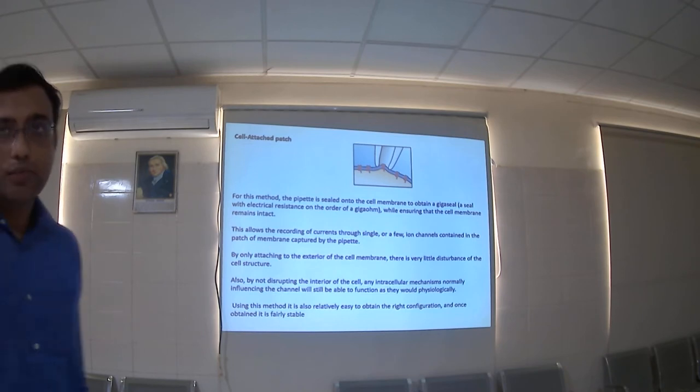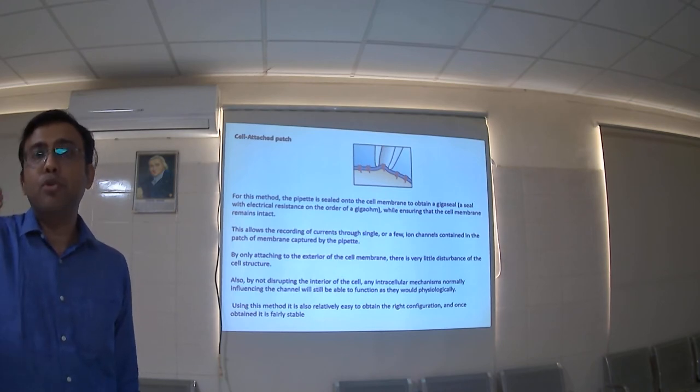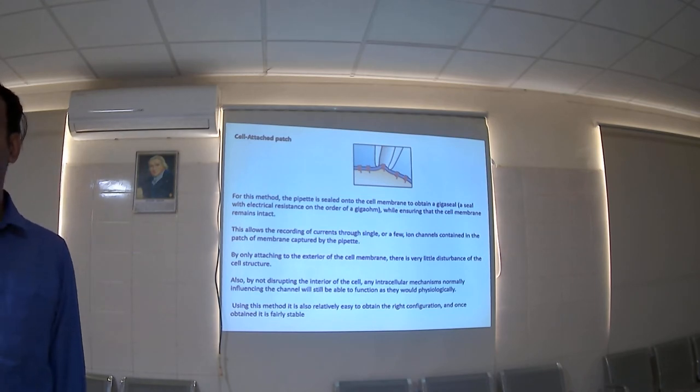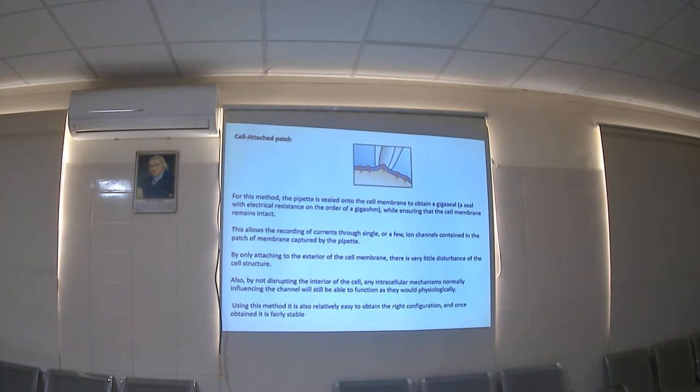ठीक है, so यहाँ तक I just want to interact with you कि आप लोगों को थोड़ा समझ में आ रहा है कि why we record ion channels, because it's very important to understand what are different classes of ion channels and how can we manipulate the ion channel. ठीक है, तो उसको समझने के लिए we should know the electrical properties of excitable tissue जहाँ पे ion channel important है. This is an example that I am carrying right now of a neuron, but this could be muscle or a heart cell or even a beta cell of the pancreas that is also electrically excitable, या अलग cell भी है और इसको physiologically भी कर सकते हैं, physiologically study भी कर सकते हैं अगर mechanism समझ में आना, या हम कोई drug की activity को भी study कर सकते हैं.